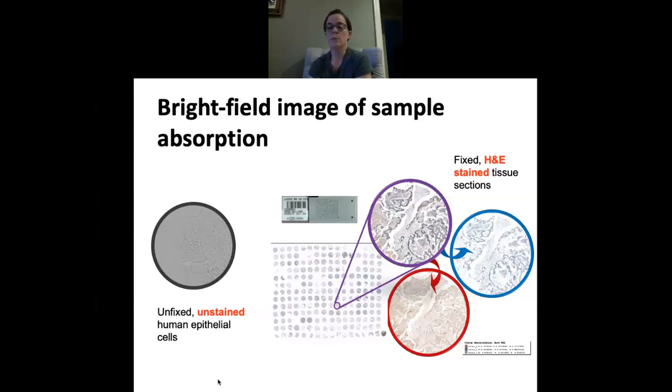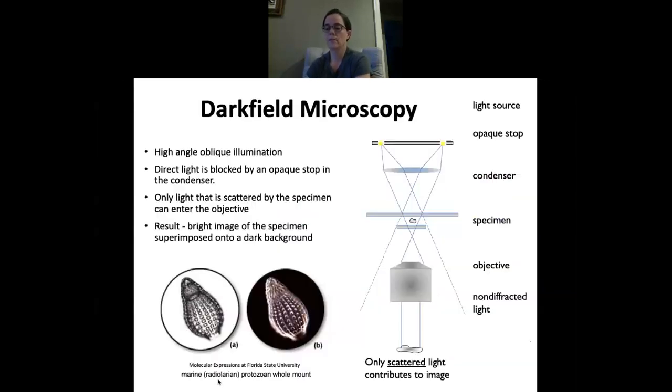The phase contrast and polarization methods that I'm going to talk about for the largest portion of this presentation use optical elements to create contrast rather than stains. So now imagine that this sample is illuminated with a high angle of incidence relative to it rather than orthogonally. Specifically at an angle of incidence that's higher than can be transmitted undeviated through the imaging aperture.